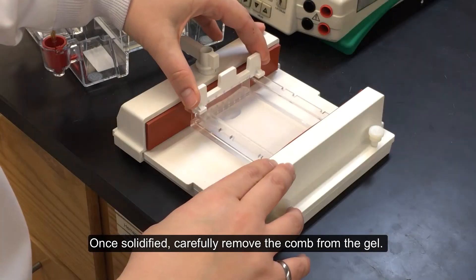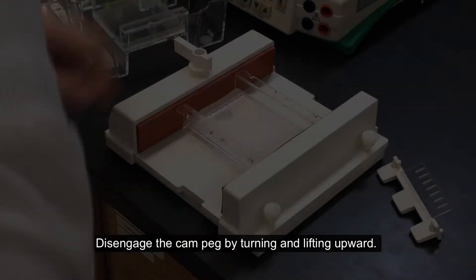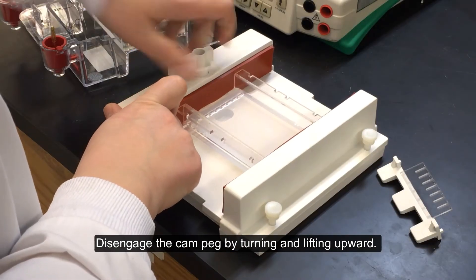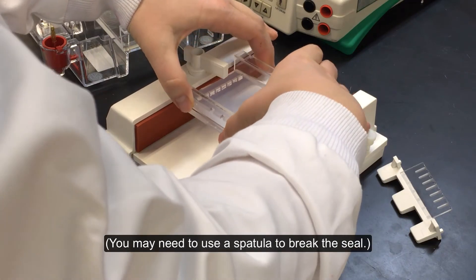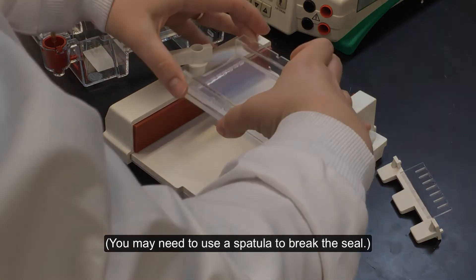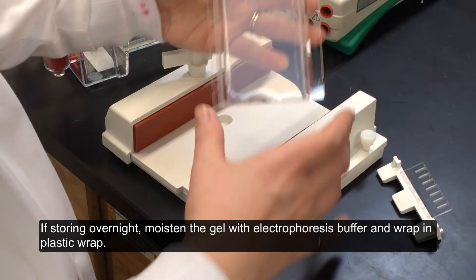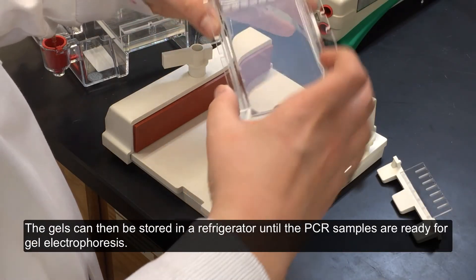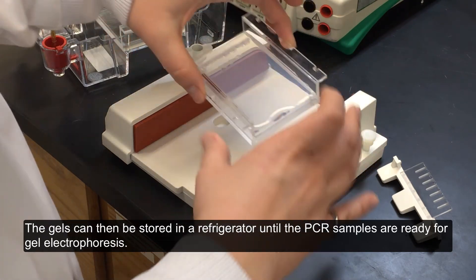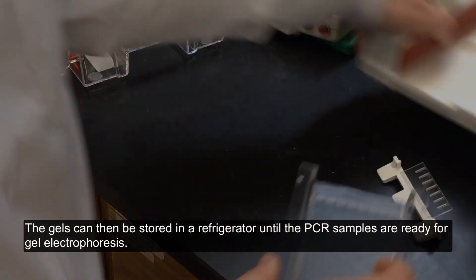Once solidified, carefully remove the comb from the gel. Disengage the cam peg by turning and lifting upward. Remove the tray from the gel caster — you may need to use a spatula to break the seal. If storing overnight, moisten the gel with electrophoresis buffer and wrap in plastic wrap. The gels can then be stored in a refrigerator until the PCR samples are ready for gel electrophoresis.